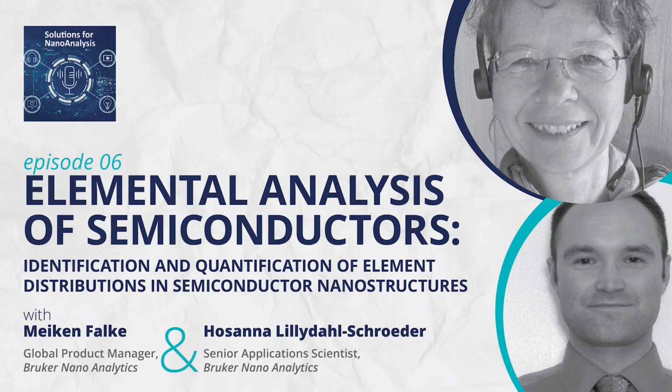We can use light elements of different thicknesses. The net on which the light element sits, so the silicon grid on which the light element is sitting, gets thinner or is replaced by something else. We get carbon-based windows, or one can use windowless detectors. The efficiency for light elements is so high, and also good for deconvolving light elements and overlapping M and L lines, that now the investigation of even boron doping and also nitrides in the semiconductor industry became actually routine.